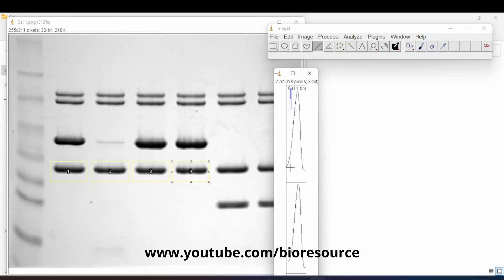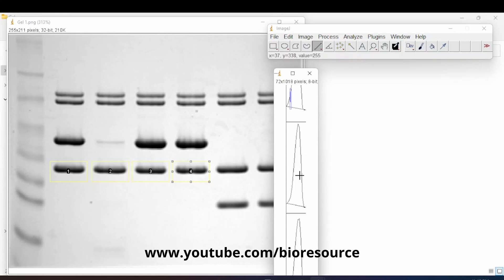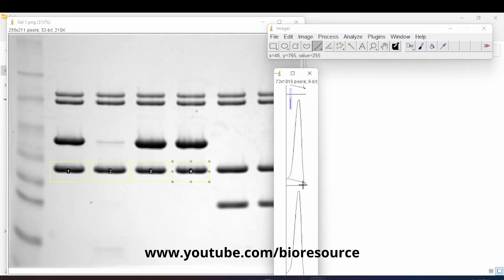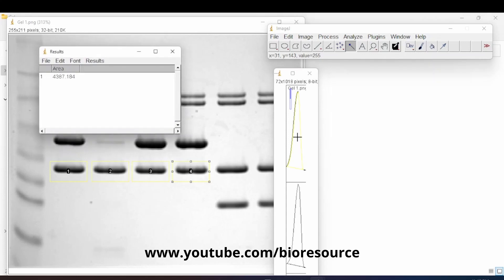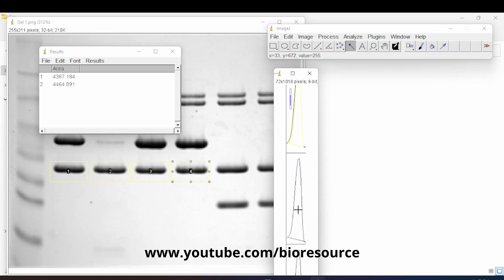Using the wand tool, mark the area under each peak — do this for each band's plot. Make sure you close all the plot windows when done. Then, using the selection tool, click on each peak region and you will get the area value displayed for each of the peaks.